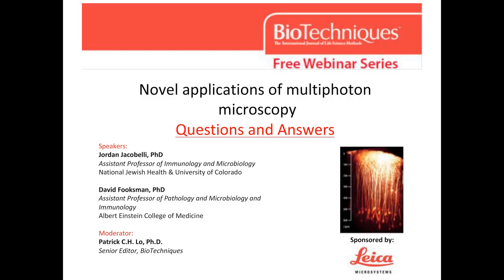Yes, so that's a very active area that I don't think either of us touched on, but there are a variety of both calcium dyes that can be used or genetically encoded reporters like these. There's a whole family of GCaMP proteins which can report fluorescence in response to calcium, and there are mice that express these that can be used both for studying questions of neuroscience or in immunology or in other fields as well.